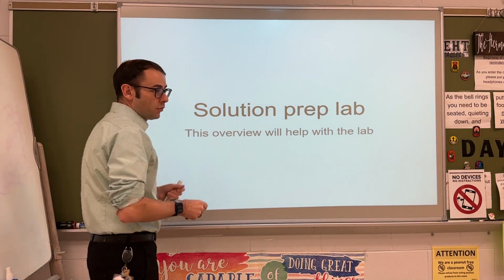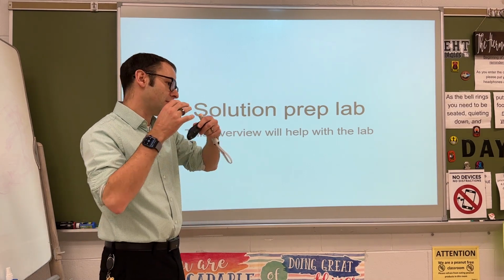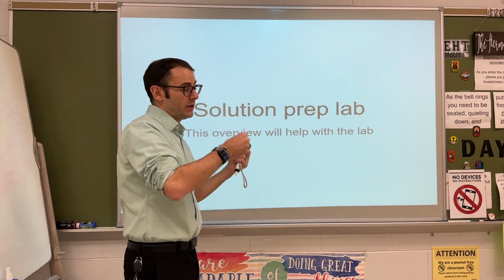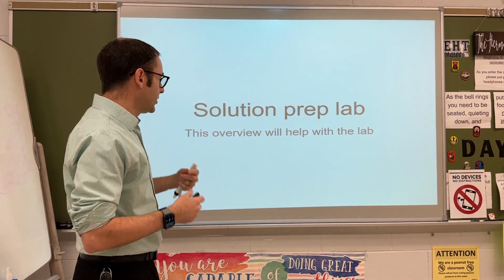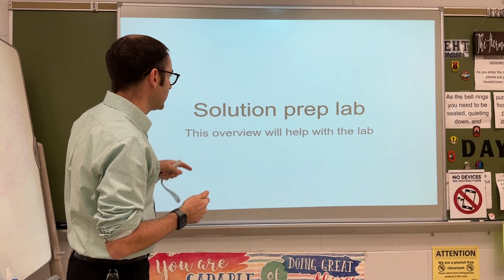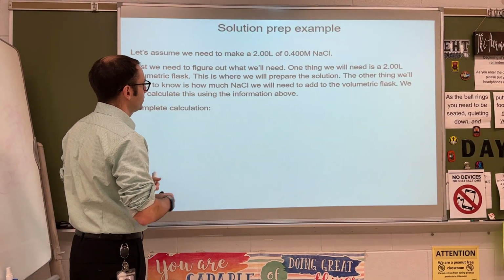So in this lab, we're going to make an actual solution. We're going to start with some amount of grams of something. We're going to need some water, and then we're going to make a specific molarity. Just like we've been doing with calculations, but now we're going to do it in the real world. Okay, so here's the example we're going to go through for this lab.